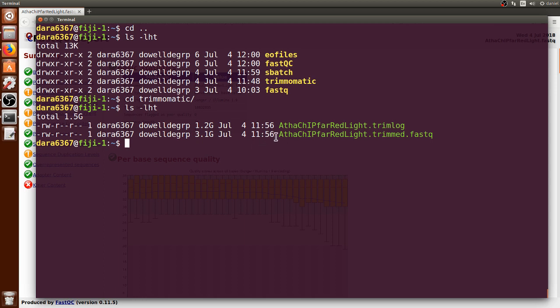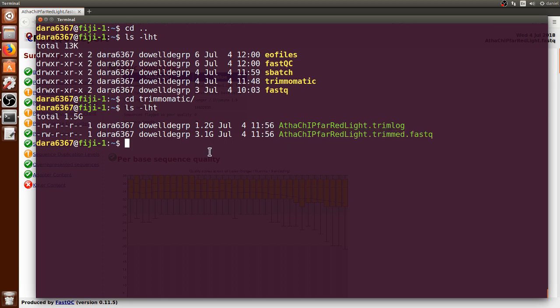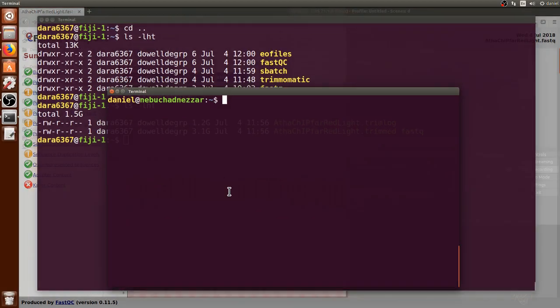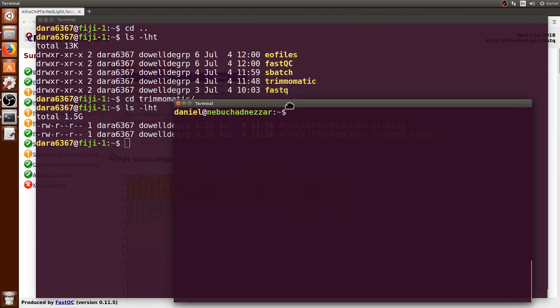I already went ahead and processed this new FASTQ file through FastQC, such that we can see now what are the differences, what Trimmomatic makes in the quality. I already transferred the results from FastQC to my own computer.